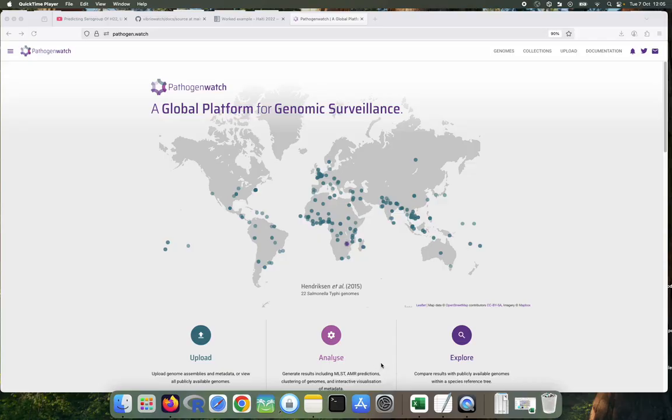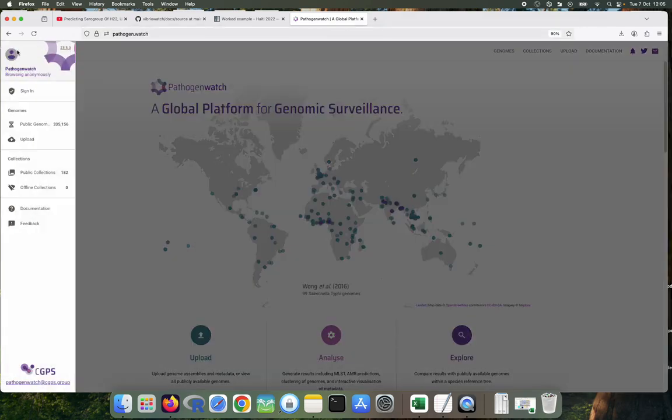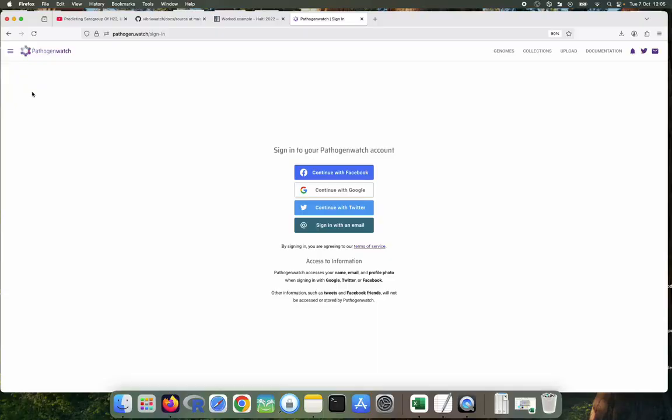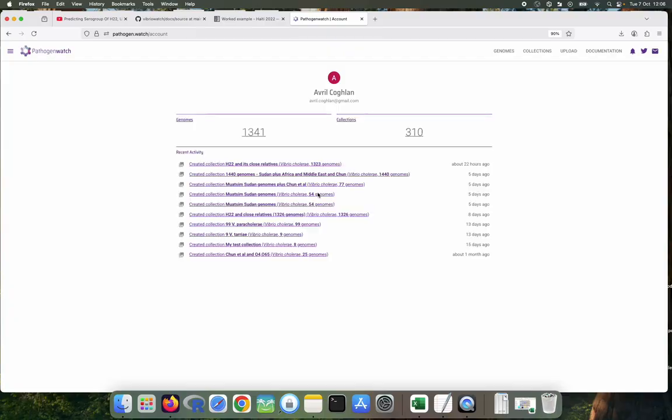To make a collection in Vibriowatch, you need to first sign in to the Pathogen Watch website. So go to the home page of Pathogen Watch, and then on the top left click on Sign In. In my case, I'm going to sign in using a Google account.